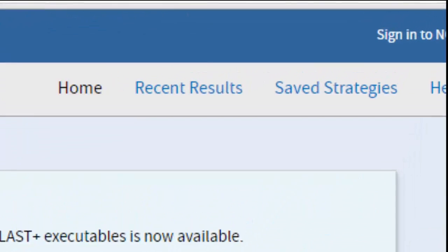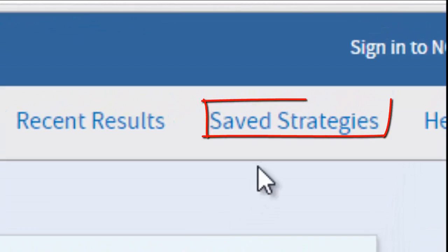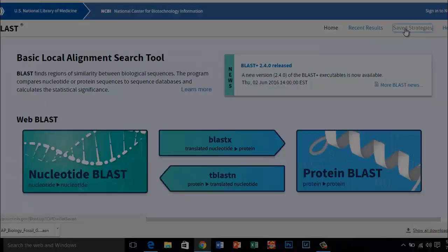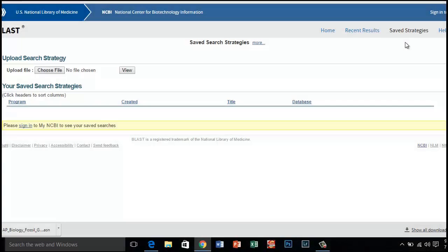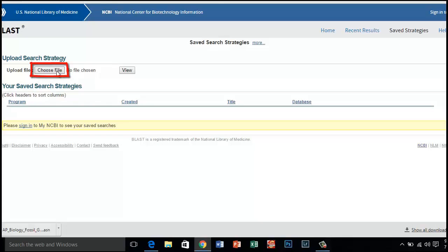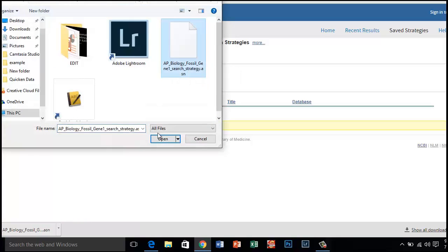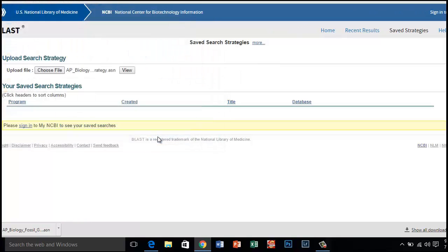Once here, click on Save Strategies. Under Upload Search Strategies, choose File, locate the gene you just downloaded, and click View.